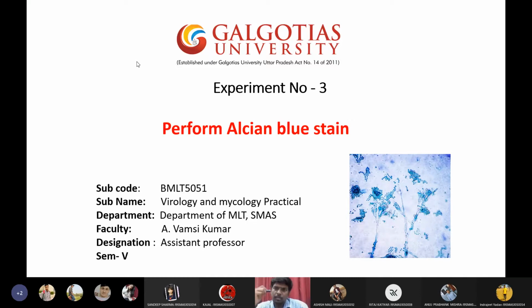why can't we use a specialized stain that has properties to attract towards the mucopolysaccharides? We know that mucopolysaccharides are really challenging to stain, but why can't we prepare a stain with specific properties to attract them? That special stain can be used to identify Cryptococcus neoformans. Traditionally we use negative staining to identify Cryptococcus neoformans.